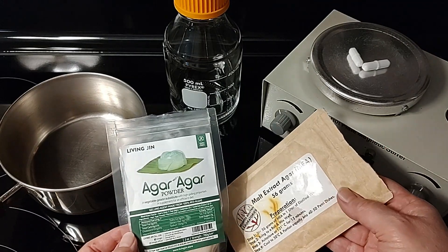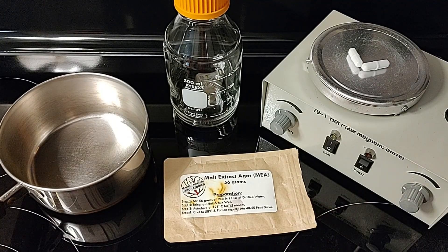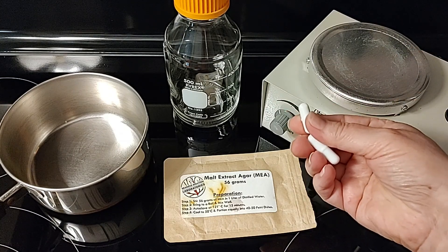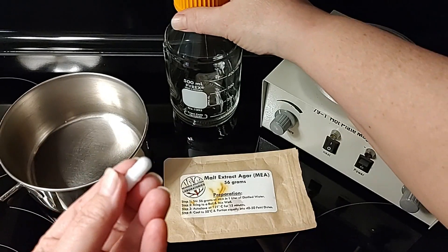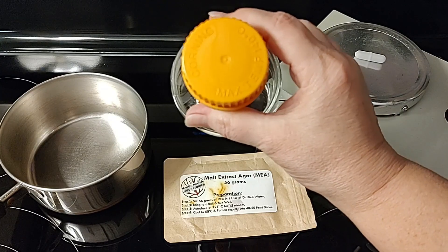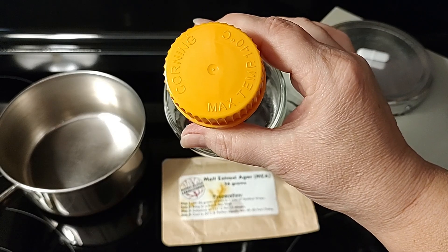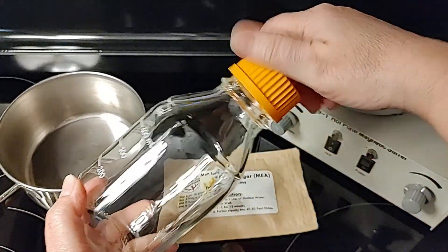Welcome back to Mycology Exploration. We're going to talk about agar in this video and how you do not need a heated stir plate to create agar recipes. We do however use the magnets that came with the heated stir plate. I'm going to show you a way to make your agar in a pan — you don't even have to turn your stovetop on. There are two different ways you can make agar without a heated stir plate.